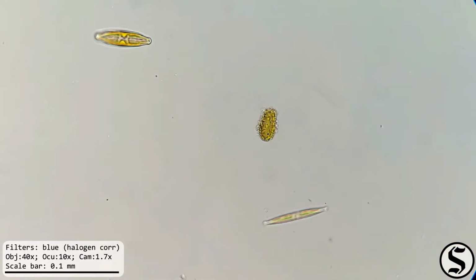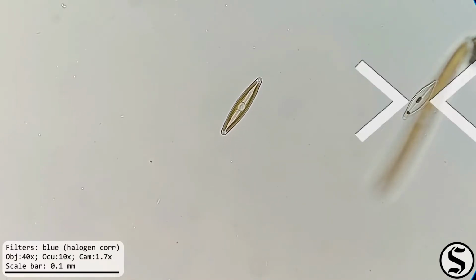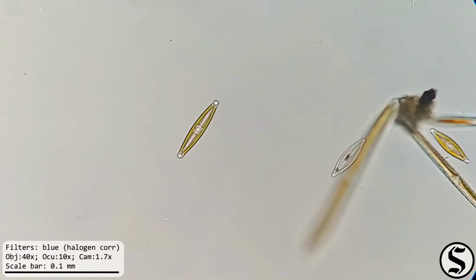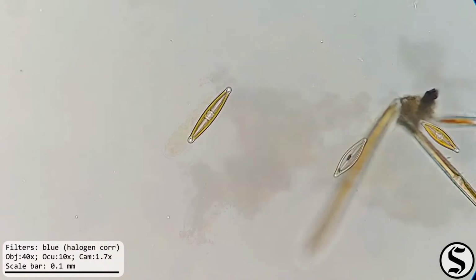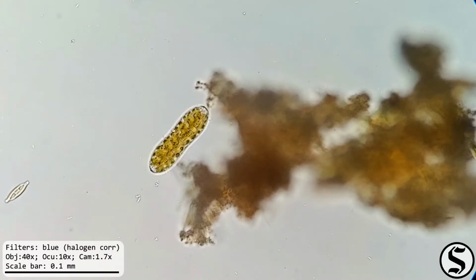Now, as we investigate these little things, if you didn't know, diatoms have a shell of silica, and in fact you can see an empty one over on the right. Those silica shells persist long after the diatoms are gone, and that's what diatomaceous earth is made out of.